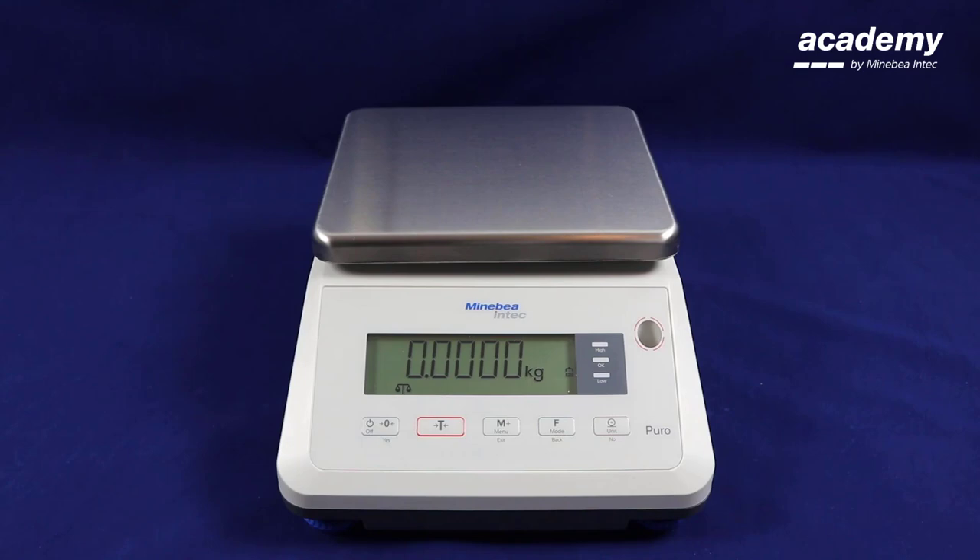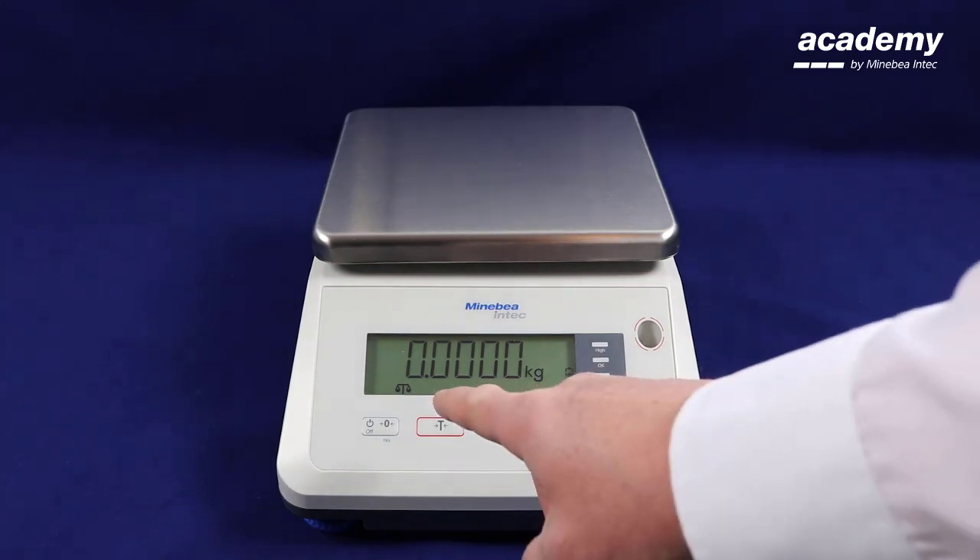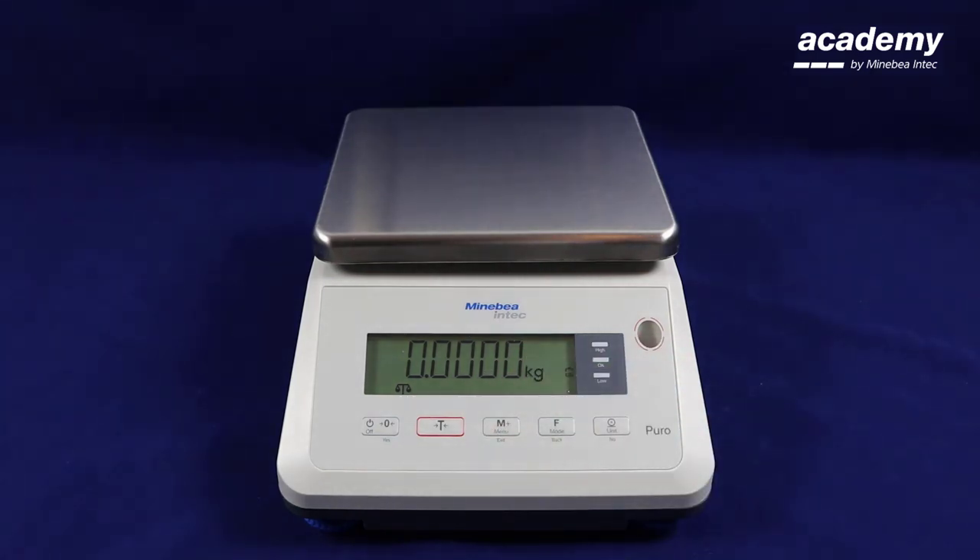Hello and welcome to Puro. In this video we will be demonstrating the counting application. The purpose of the counting application is to determine the number of parts which have approximately the same weight.